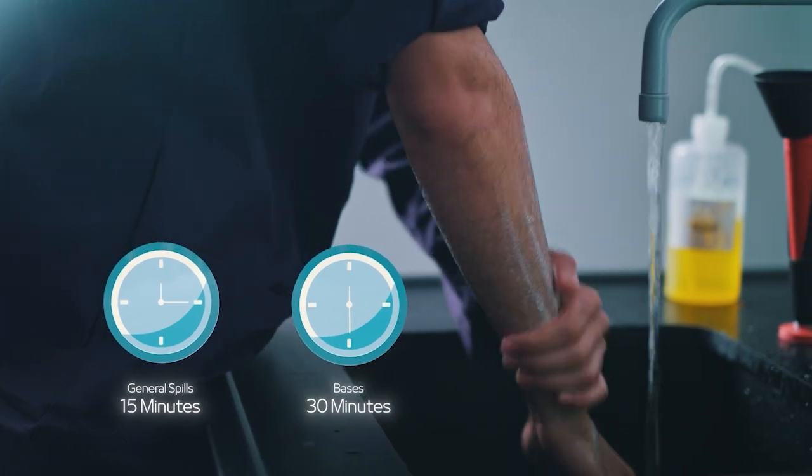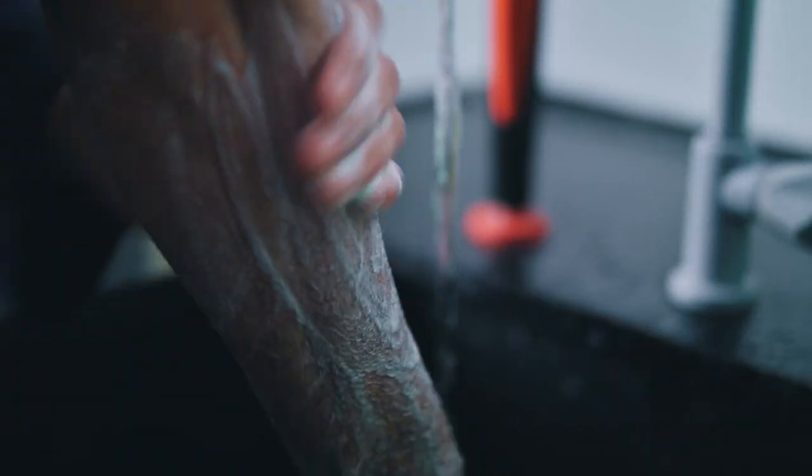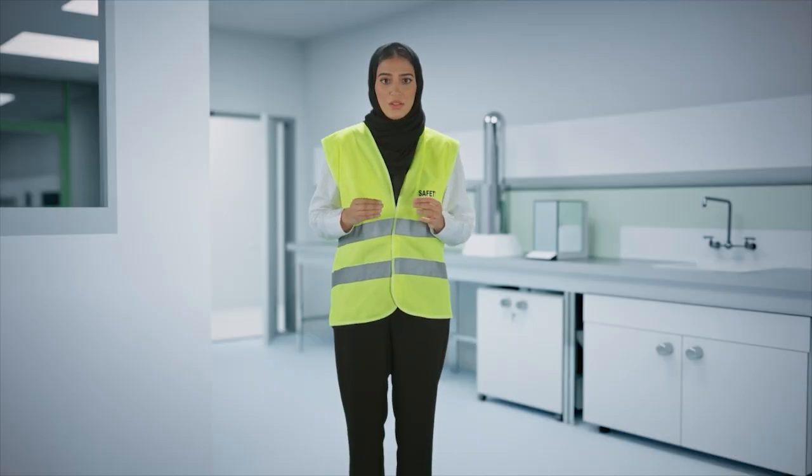After the initial rinse with water, wash the entire area of the affected skin with warm water and soap. You or a fellow student should notify your instructor as soon as possible. After rinsing your skin, check the MSDS to see whether any delayed effects should be expected. It is advisable to seek medical attention for even minor chemical burns.